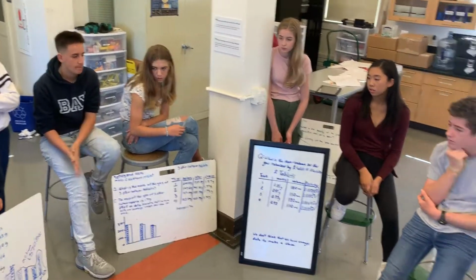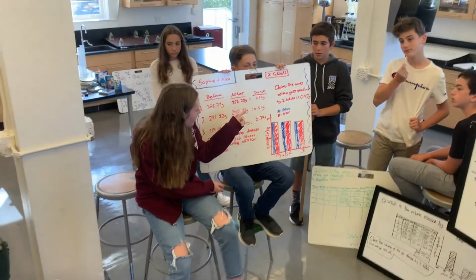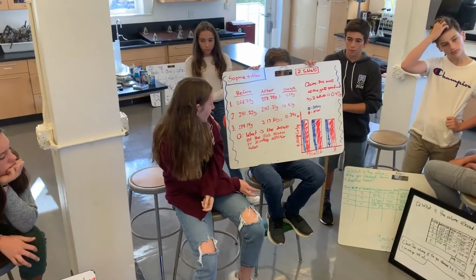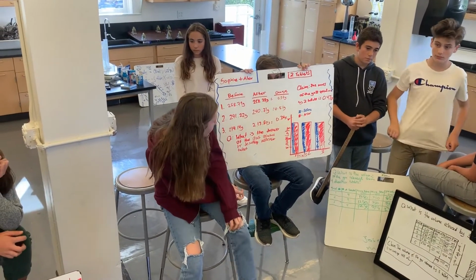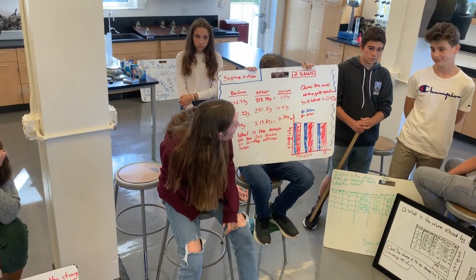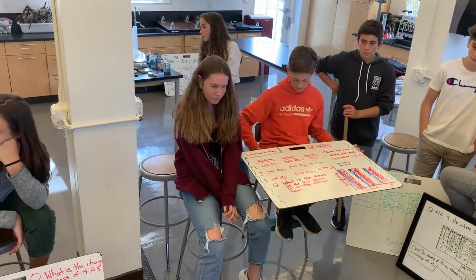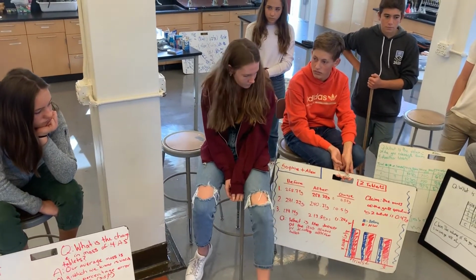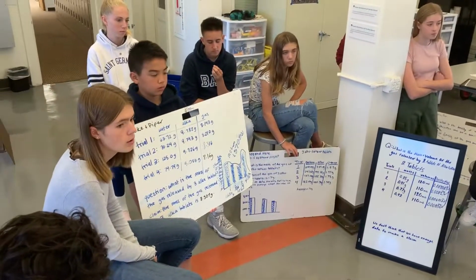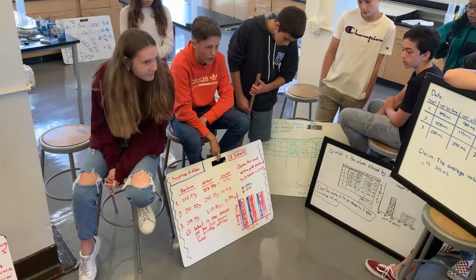Okay. 2 tablets. That's us. Our question was, we measured before and after, found the change, and then averaged out all of our trials. We did 3 trials, and we said that the average mass of the gas released is about 0.47 grams. Wait, for yours, when you were measuring it, you also did it before and after of the water with the mass of the tablet? Is that 0.34 grams? Yeah. Get some hard numbers.